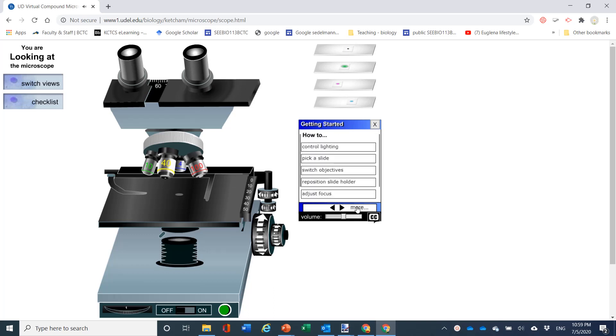This simulation works very much like a real compound microscope. To succeed in getting a specimen into view, follow this sequence of steps.